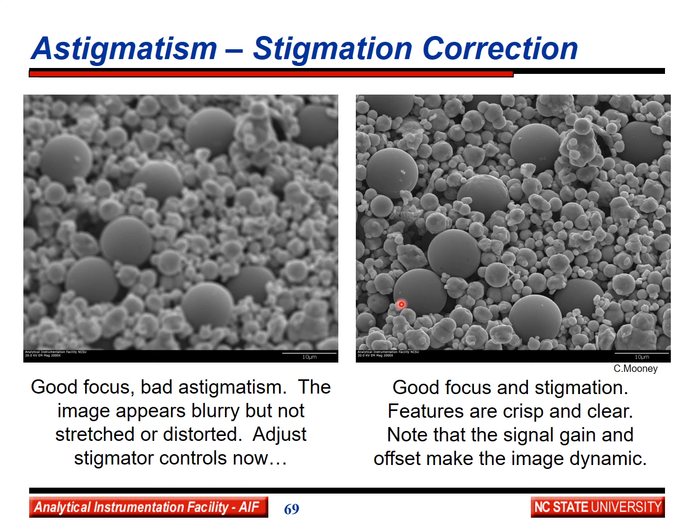Look back at the good image. Just above the laser pointer is a sharp, crisp little detail. It's a little piece of steel on top of a latex sphere. Here is the same feature in the astigmatic image, and if you again squint and use your imagination, you can see a little smudge.